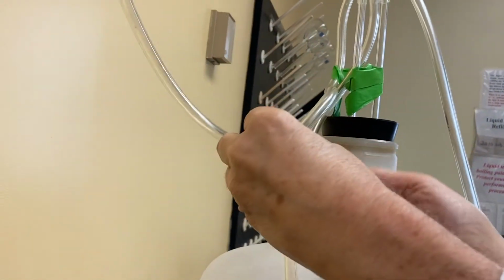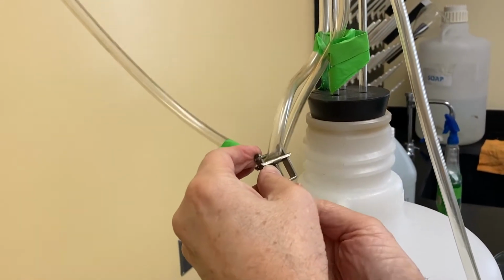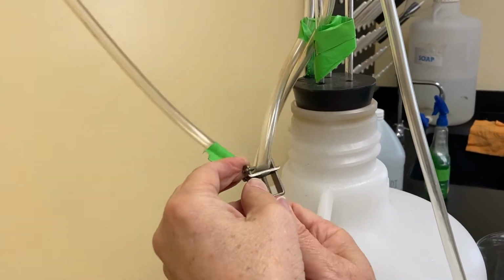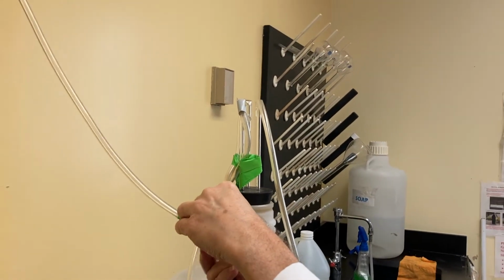There we go, that'll do. And then as you tighten it, you want this to be horizontal as much as possible. You don't want the tube moving off to the side. You might even want a piece of paper towel to really tighten well when you need to do that. Okay, I'm going to reopen it for now.